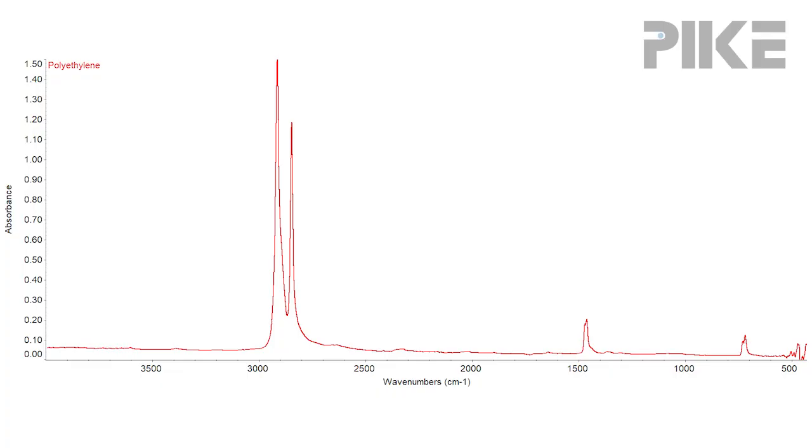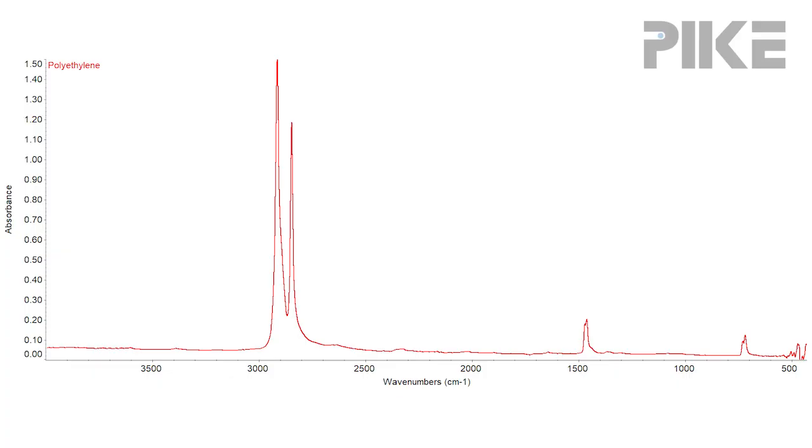Hello and welcome. Let's start by looking at a single reflection diamond ATR spectrum of polyethylene — it has all the characteristics of polyethylene. However, let's take a little deeper dive into this spectrum, where you can start to see some questionable attributes.